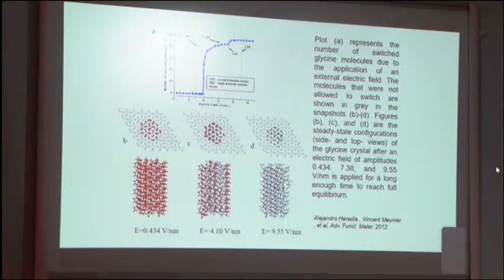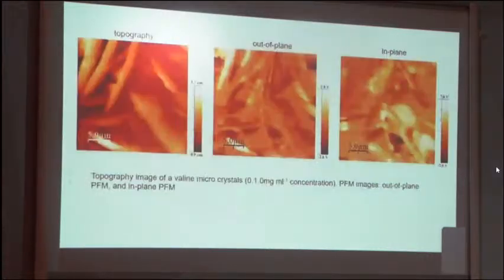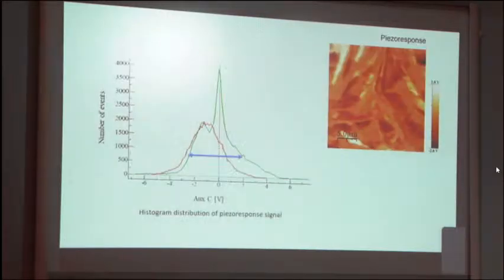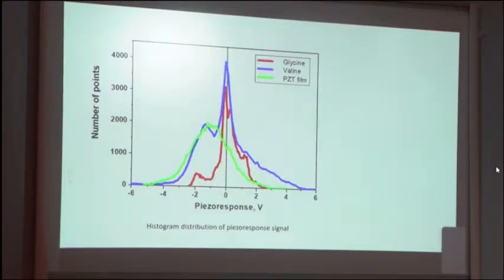Okay. Modeling. A few words about determining the piezo response coefficient. This is an example for another material, valine, another amino acid. But the question is, what is the piezo response? This is a little problem, because we measure locally, and our signal depends on the orientation and on the statistics. But it is not possible to obtain big statistics, because we measure locally.